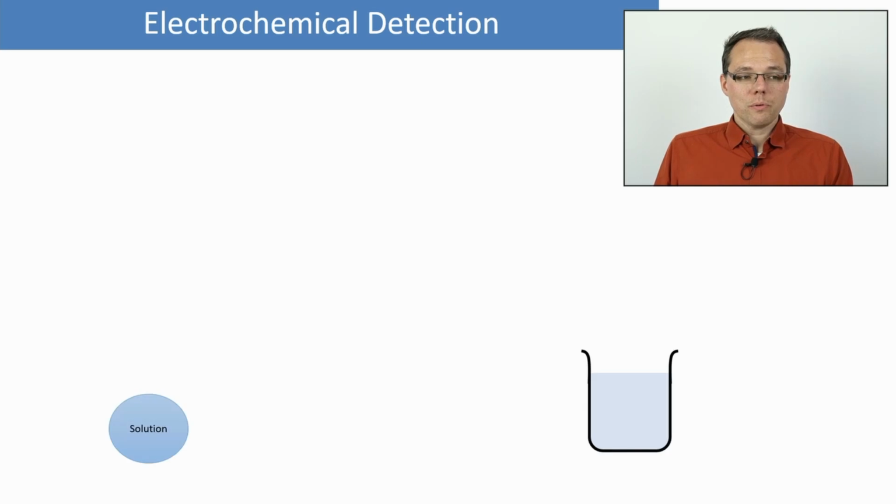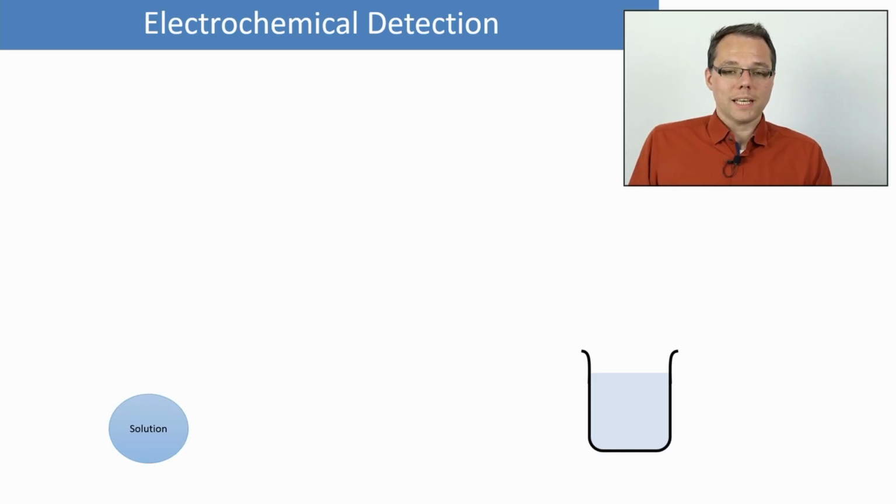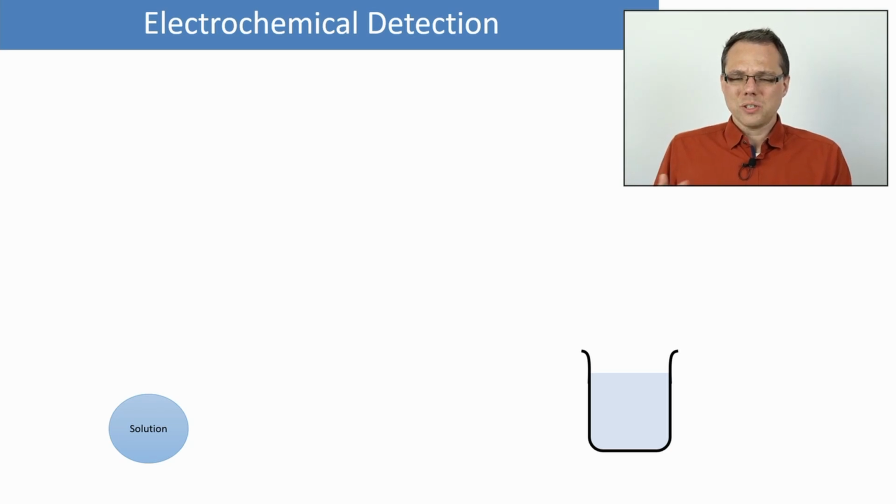Okay, so how do we perform an electrochemical detection? Because all that sounds very complicated already, and you're like, okay, how do I do an electrochemical measurement? Well, if you've been with the previous installments, most likely you have been, you now know that slide, but just for the ones that are new, you have a solution and you want to measure something in the solution.